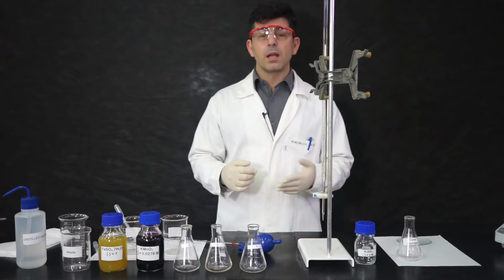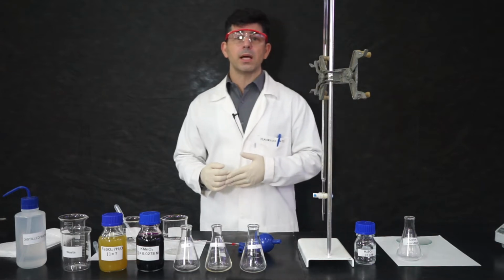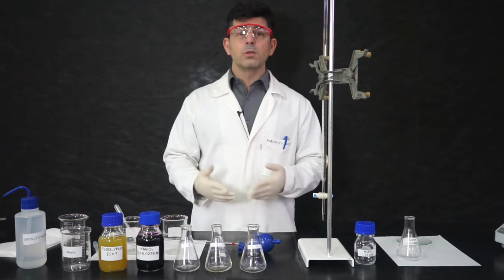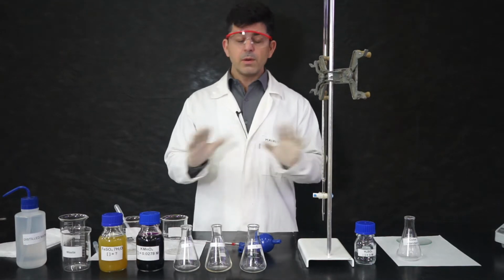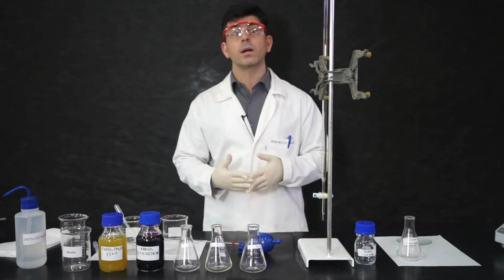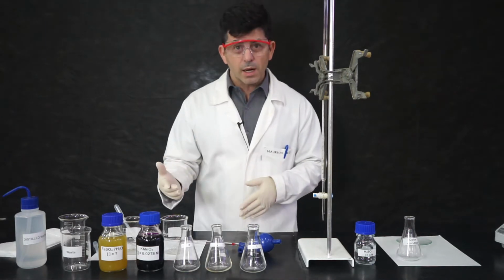The iron can be oxidized by potassium permanganate, and then through this titration we will be able to determine its percentage. The very first thing is, you're going to do a lab report on this. You need to understand what kind of equipment and materials we are using.